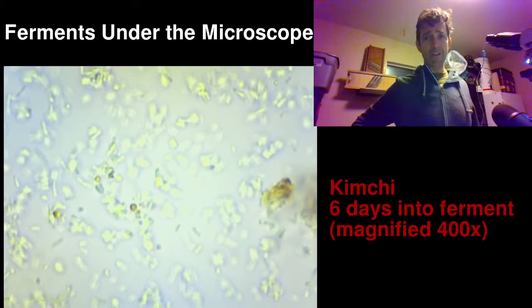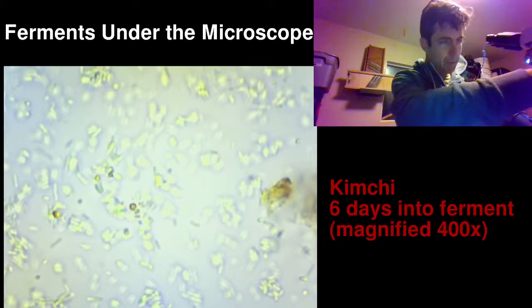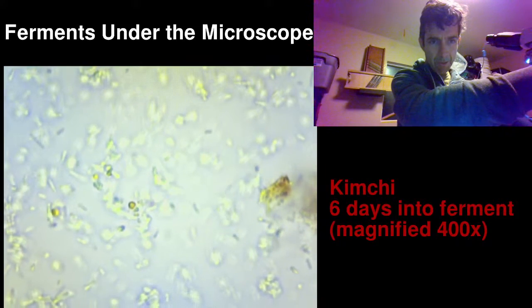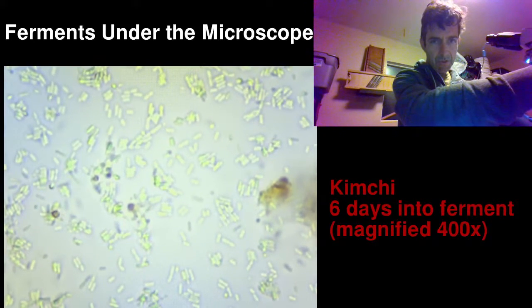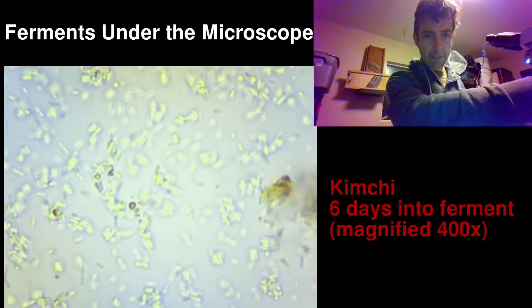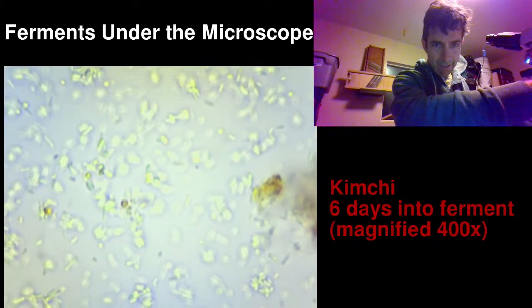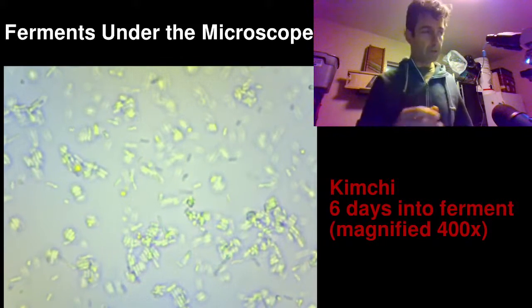I believe what we're seeing is the lactobacilli, which are the rod-shaped bacteria primarily responsible for vegetable fermentation such as kimchi. Sorry, it's a pretty basic camera — if this goes well I'll definitely upgrade to get more megapixels. I'm rotating the focus knob, which moves up and down through three dimensions of the liquid. Even though it's very thin it's still three-dimensional, and you can kind of see the microbes hanging out — they're rod-shaped.